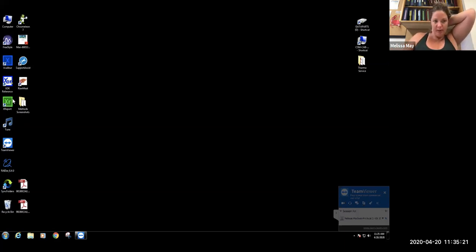The two programs that are going to be important: the first one is called Tune, which is responsible for running the Q Exactive Plus by itself. This allows you to have manual control over the instrument to change various parameters and run things as is. It also allows you to record data and your spectra in this program, but I don't know how to do it.